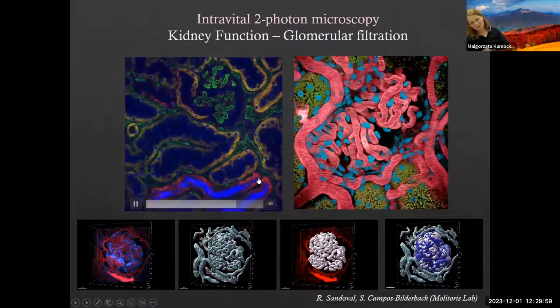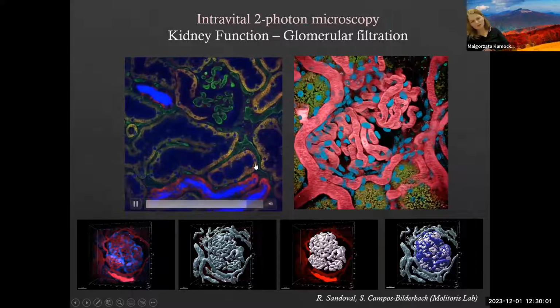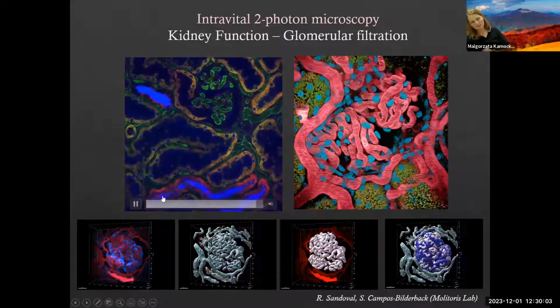Ruben additionally injected mitochondrial probes into these animals. So we see mitochondria labeling distal tubule and collecting duct. This was done with TMRM. And then he also used rhodamine 123 to show other tubules which do not pick up TMRM.